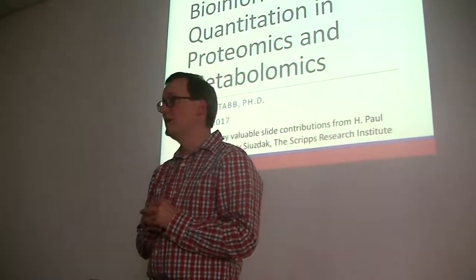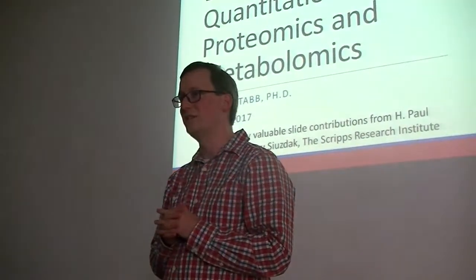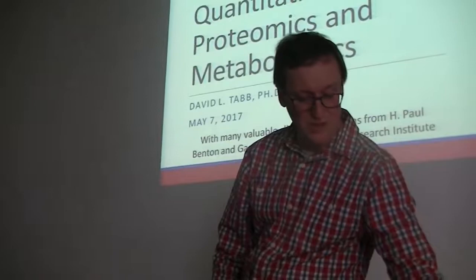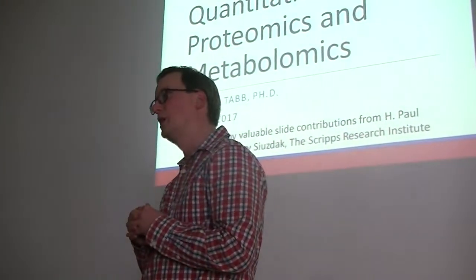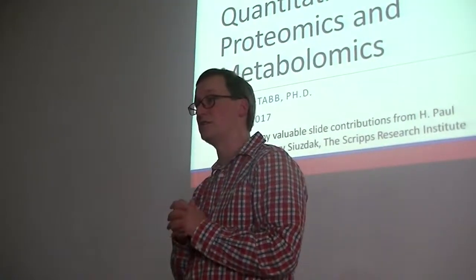All right, it's time for the anti-penultimate lecture for the Bioinformatics series. We're on lecture number 6, if I'm not mistaken. So today we will be talking about quantitation. We'll be talking about the set of technologies that most frequently show up in biomarker hunts when we're looking at the world of proteins, and when we're looking at the world of metabolites as well.